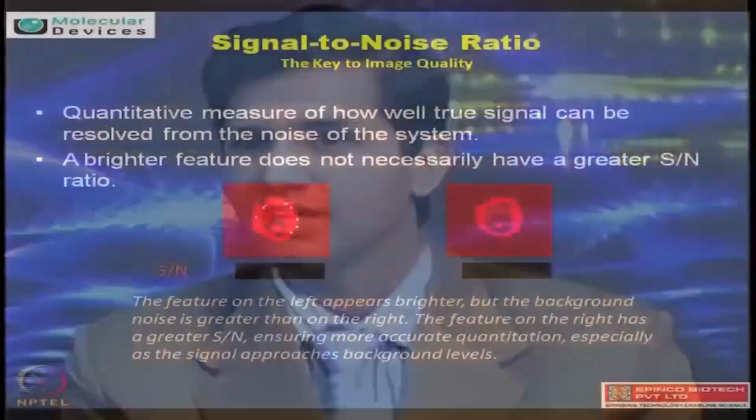So as you go for the signal corrections, what you're trying to see, same thumb rules of not looking at saturations, right. And then you expect the image is going to be with least background, so the valid information which is coming in the form of intensities becomes a true signal.